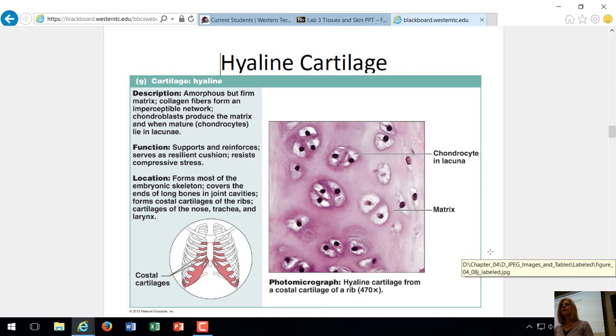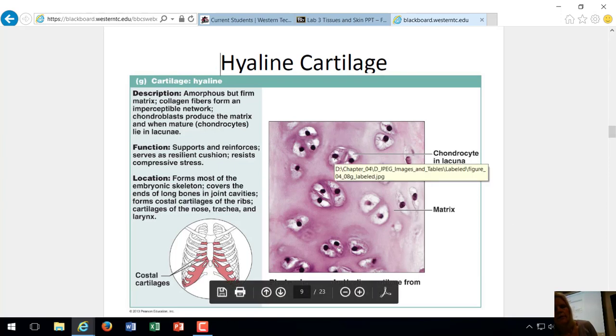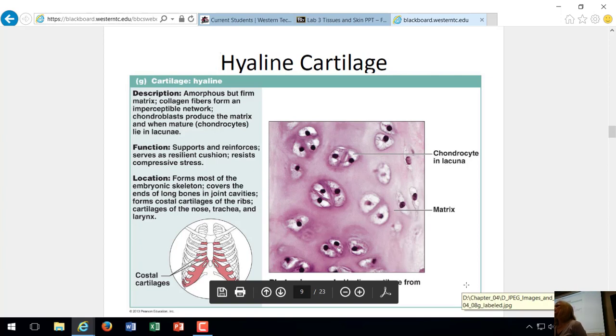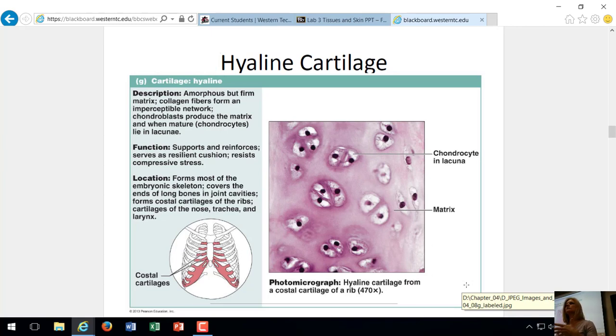A way to look at this to identify this from other tissues is it looks like fish eye soup. Can you see kind of the nuclei of the cells that make the cartilage? And then there's this light purple kind of smooth matrix around it. That's hyaline cartilage. There's a lot of flexibility because that light purple kind of smooth region of this tissue is that flexible shiny cartilage you see like if you're eating chicken on a chicken bone. That's hyaline cartilage. Fish eye soup.